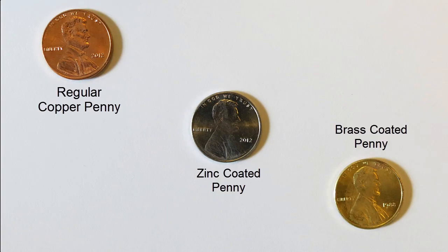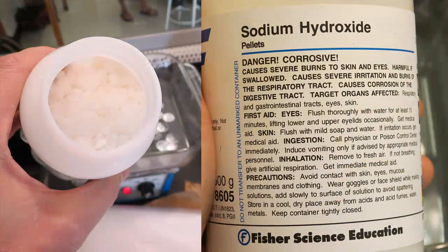First thing we'll need are some shiny pennies. The year doesn't matter as long as the outside is copper. Then we'll dissolve sodium hydroxide pellets in water to make a really strong basic solution. Sodium hydroxide is fairly dangerous, so we're going to be very careful with this.